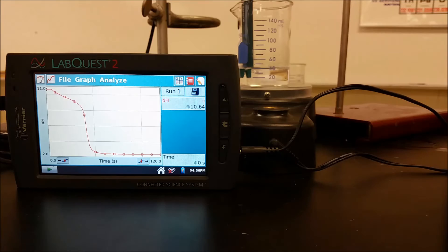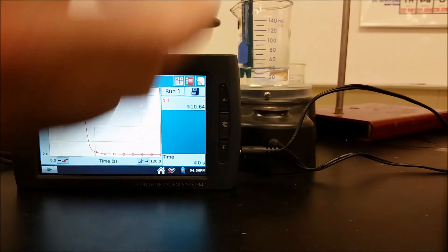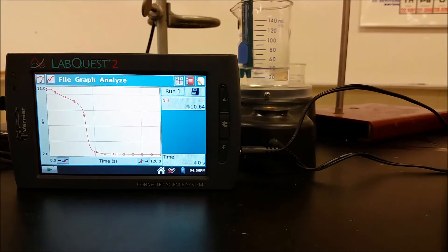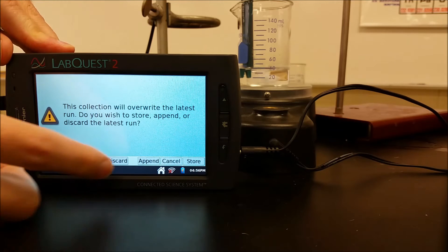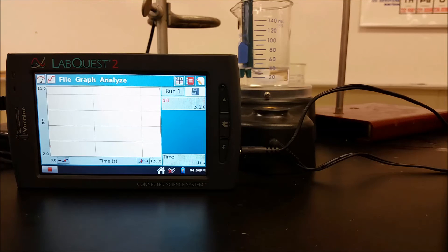Now let's go ahead and take a look at the same titration with the exact same acid and base, but now we're going to put a different indicator in. So now we're adding phenolphthalein to this, and that has a pKa of 9, so that's going to change color when the pH is within a unit of 9.